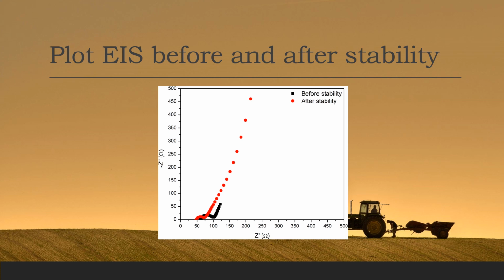In terms of charge transfer resistance, during charging and discharging, some material or composite is activated. That's why the charge transfer resistance, in some cases, becomes smaller. In the RS, maybe there's not much deviation. But in certain cases, you can observe both the Warburg line and also RCT becoming bigger and longer. So it depends on the material.